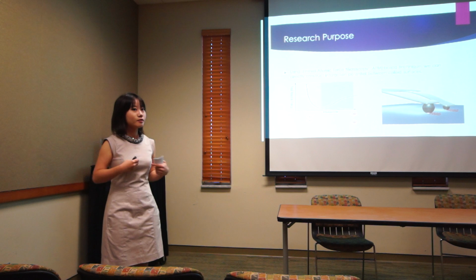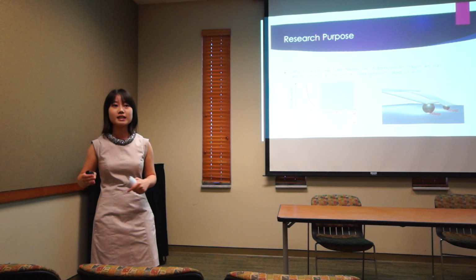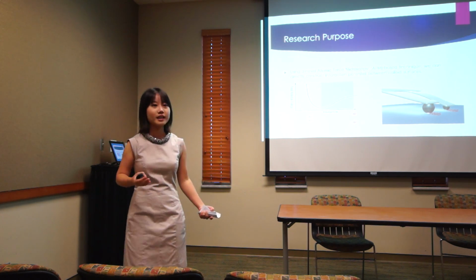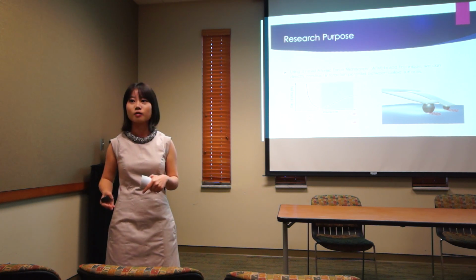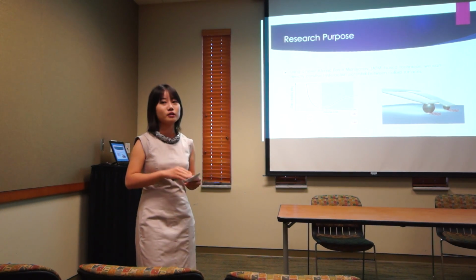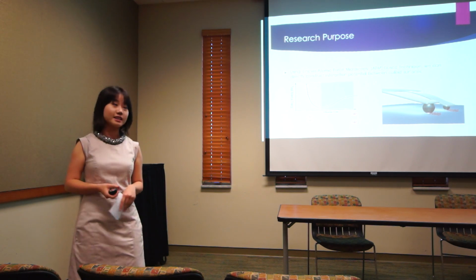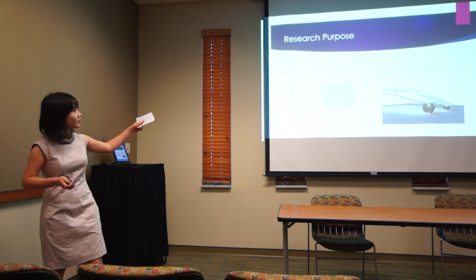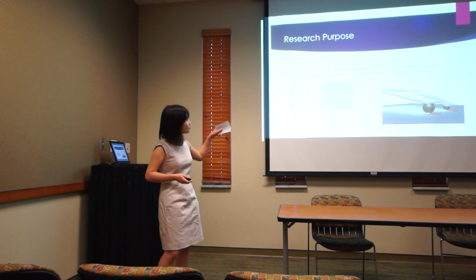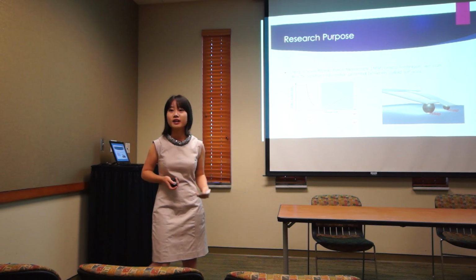So the purpose of our research is to use a novel atomic force microscope-based technique to construct a complete intermolecular potential between individual colloid surfaces. With the intermolecular potential, we will be able to directly measure the zeta potential as well as other important colloid properties. So here's the image of what interaction potential will look like, and that is a kind of image of how we set up our experiment.